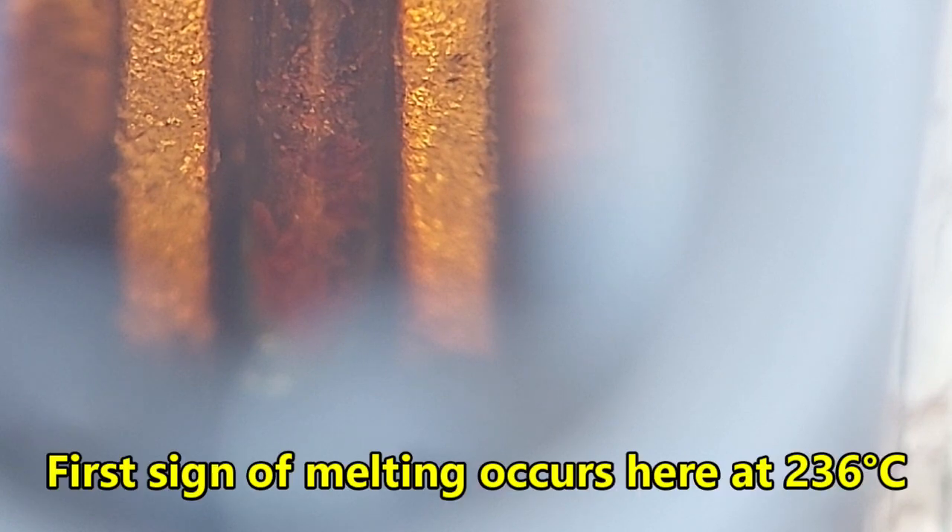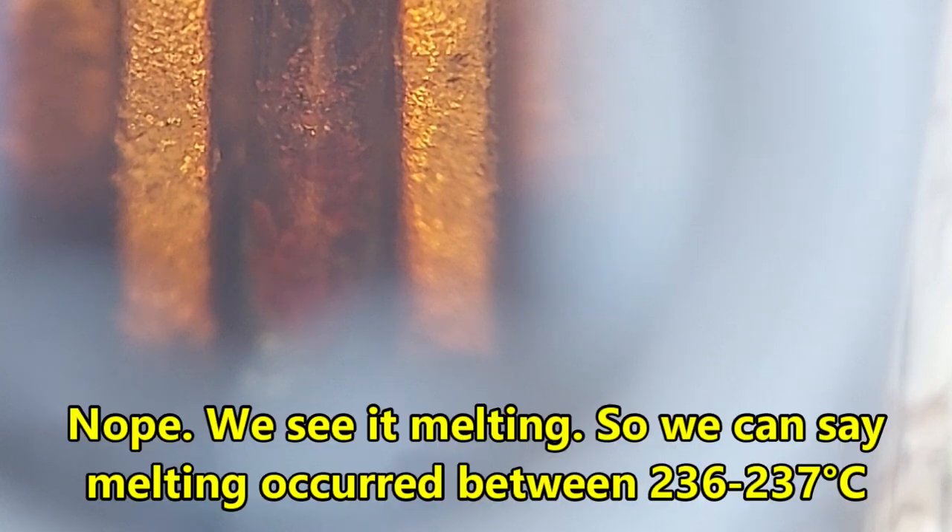We need to touch it up just a little bit more. Stay focused. 235°C. Come on, baby — just give me two more degrees C, that's within the margin of error. 237°C!